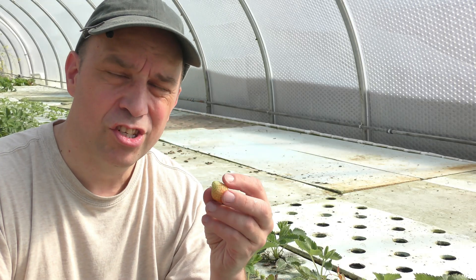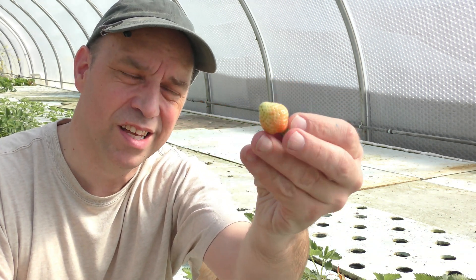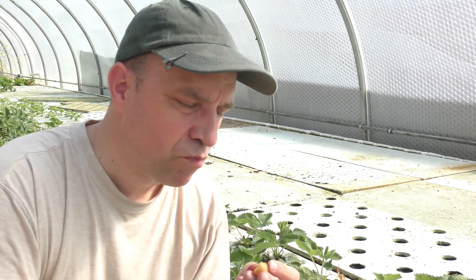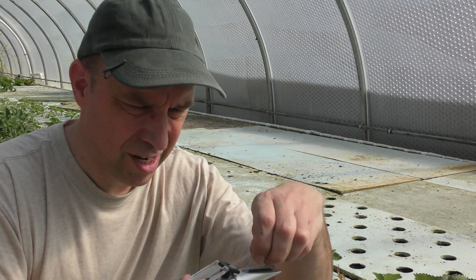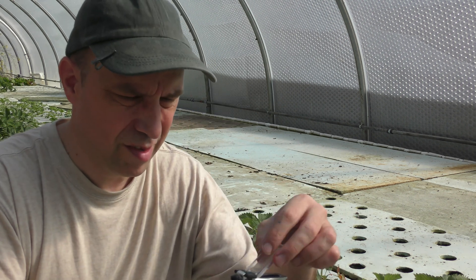Seeing how little sugar was in that overripe one, I'm now curious to see what an extra underripe one looks like. So let's try this one out. Definitely a little more tart, needs a little extra squeezing — not as juicy. That's just shy of 11.